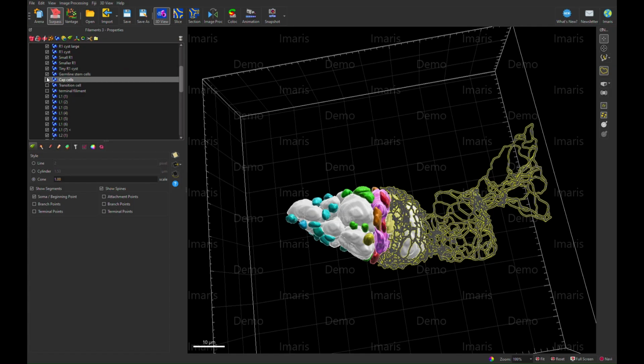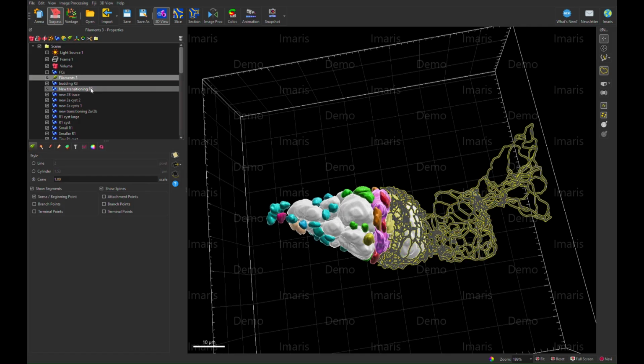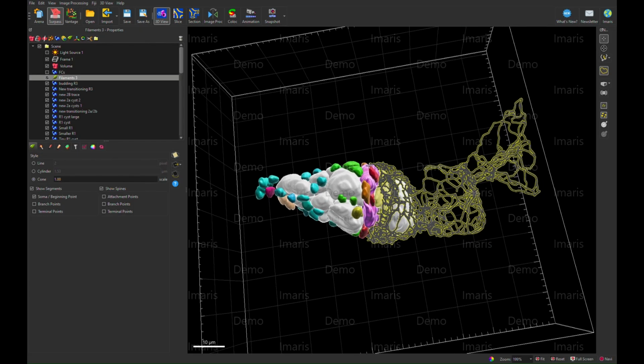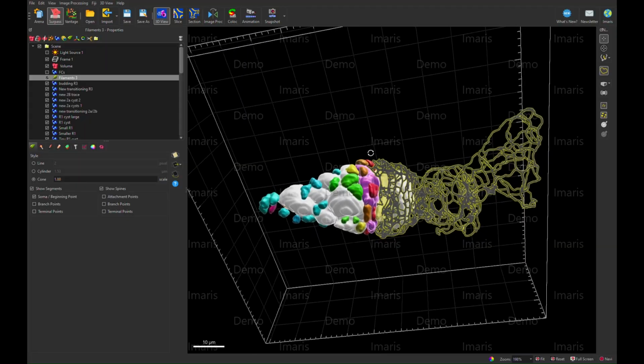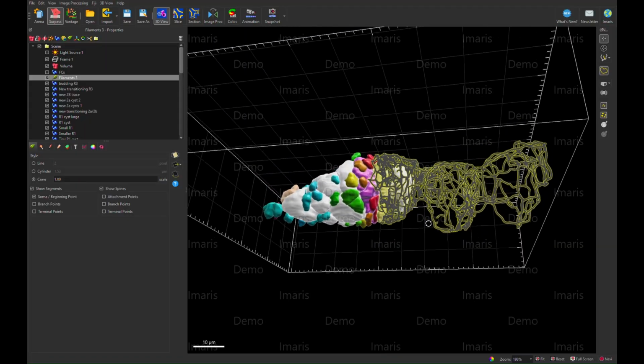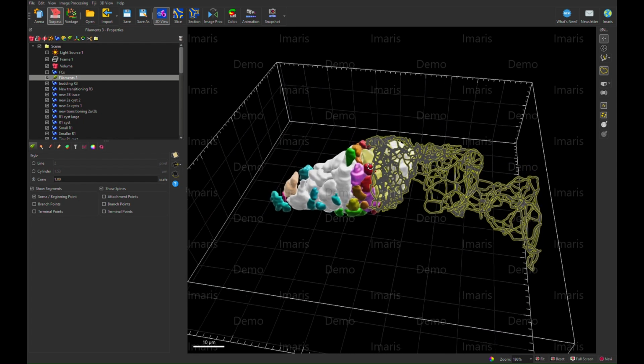Okay, now with everything turned on, we once again have a full picture of the germarium with the follicle cells being labeled in pink. Again, that's a little bit much going on, so we'll just look at the remainder of this. Okay, we'll rotate it so you can see from every angle how these escort cells and cysts are all embedded with each other, interacting constantly.